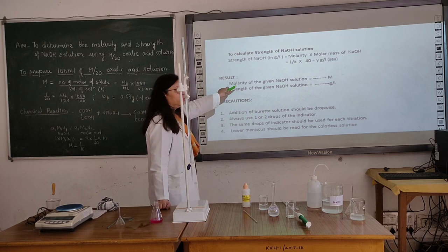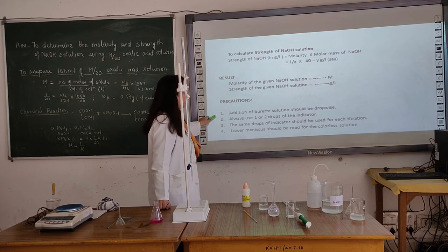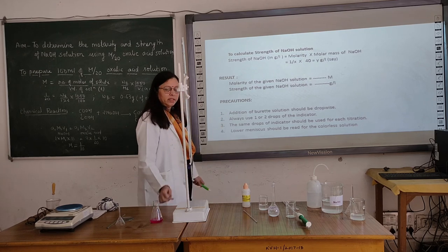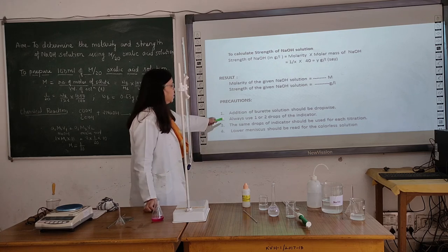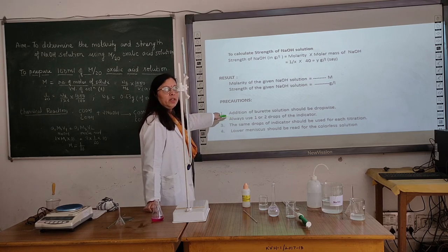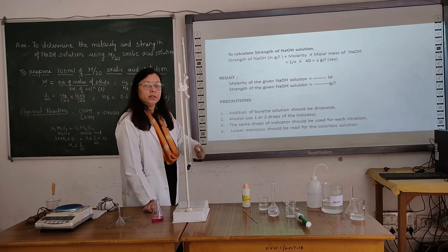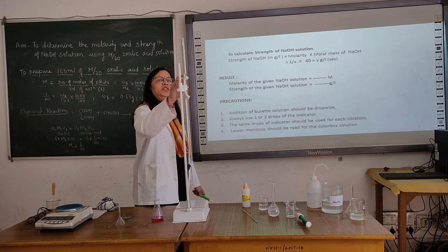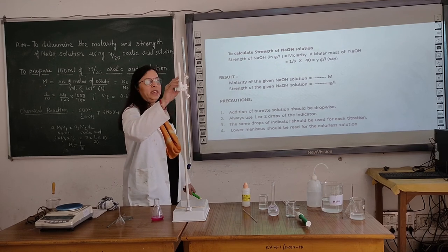We write the result: the molarity of the given NaOH solution and also the strength of the given NaOH solution with proper units. Precautions: addition of NaOH solution should be drop-wise — otherwise we will get a dark pink color. Always use 1 to 3 drops of indicator and never use more. For every reading, the same number of drops of indicator should be used. The lower meniscus should be read for colorless solutions — whatever reading we measure, the lower meniscus should touch that particular mark.